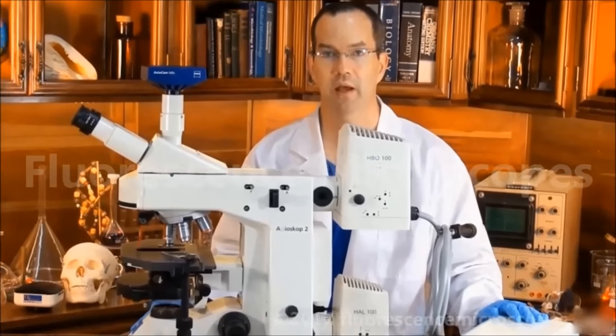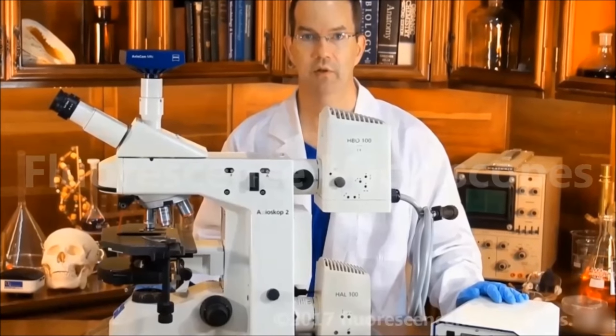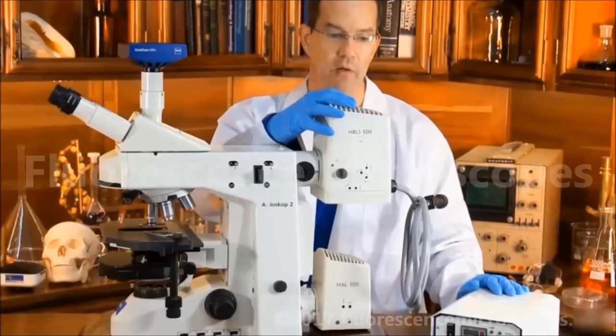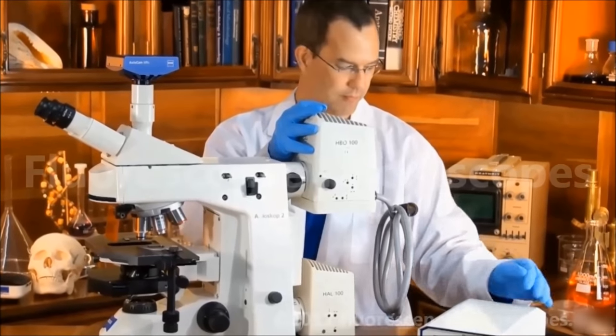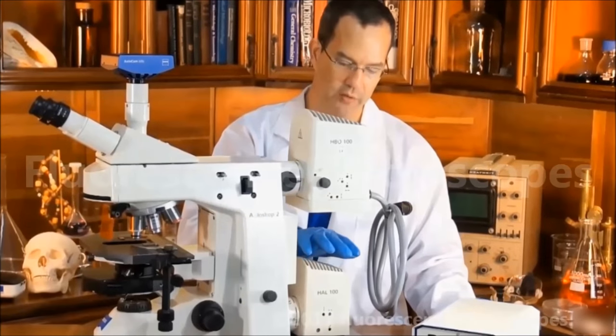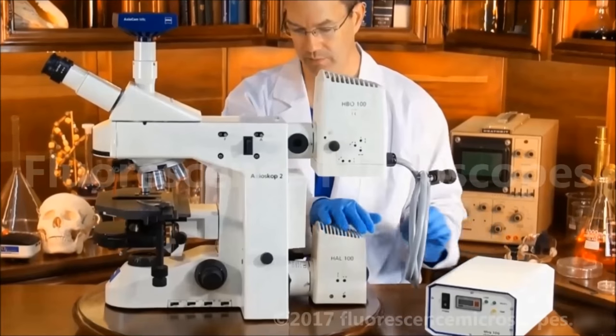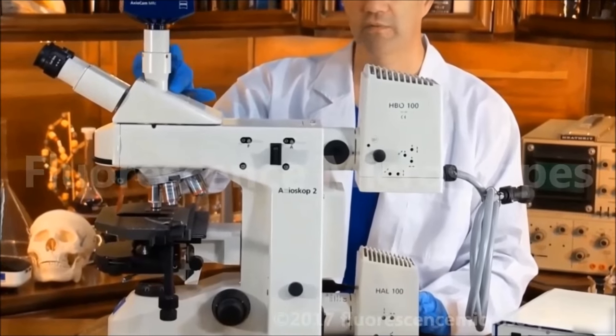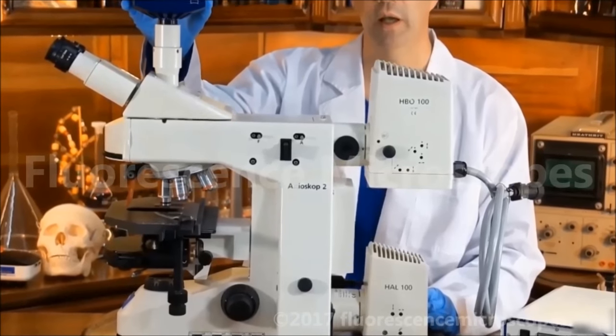This is a Zeiss Axioscope II upright fluorescence microscope. We've configured it with a 100-watt HBO lamp housing with a power supply, a 100-watt halogen transmitted illumination system, and a trinocular head with a photo port and a C-mount with a camera attached.